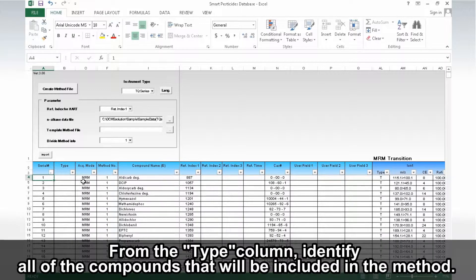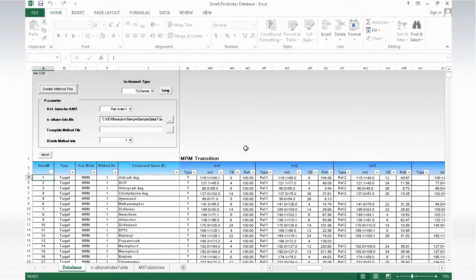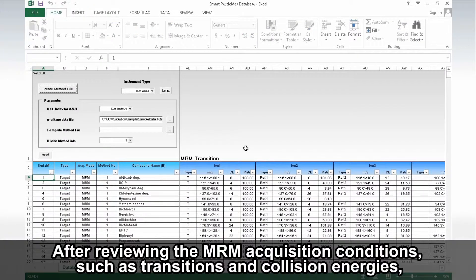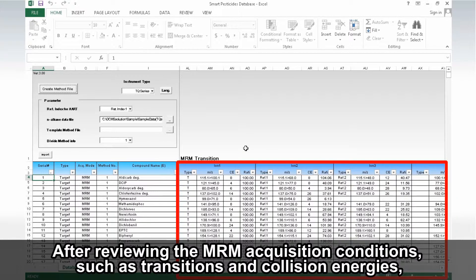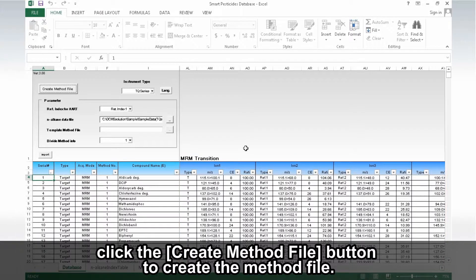From the Type column, identify all of the compounds that will be included in the method. After reviewing the MRM acquisition conditions, such as transitions and collision energies, click the Create Method File button to create the method file.